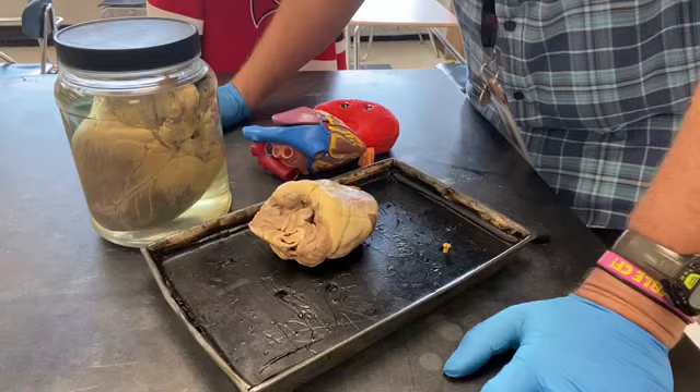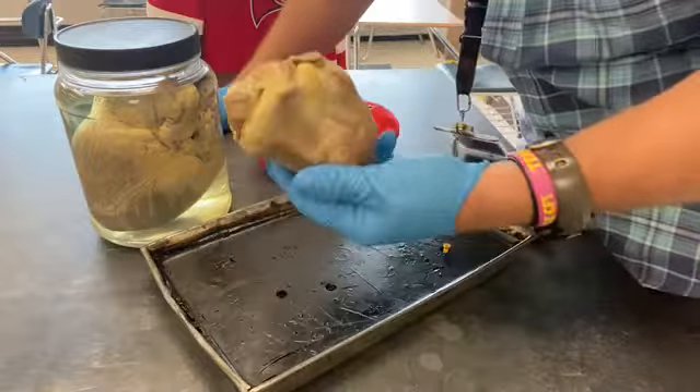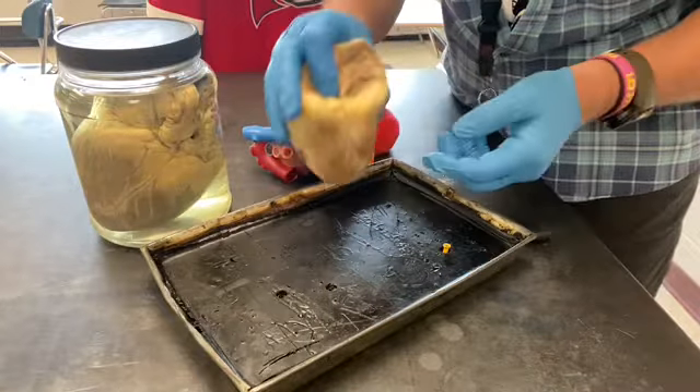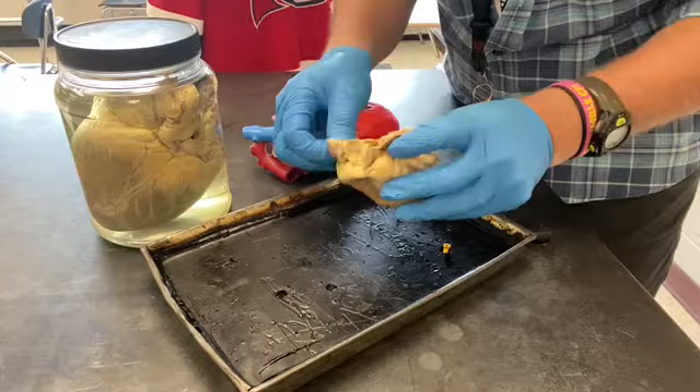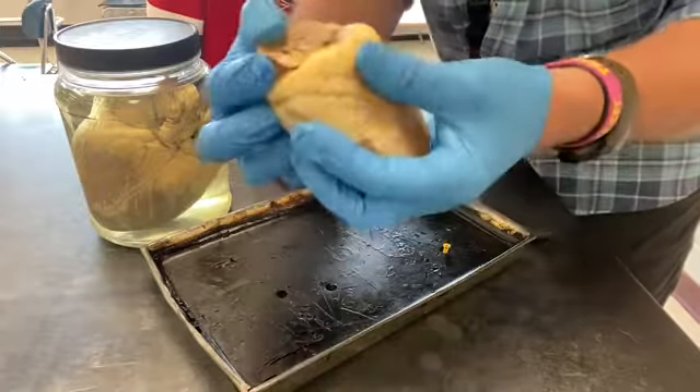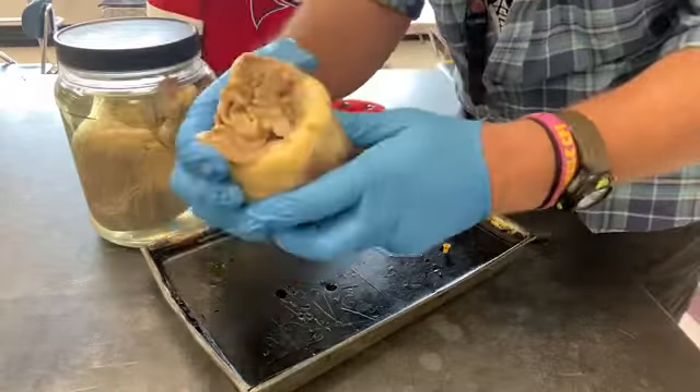The pointy end is the bottom of the heart; all the action takes place on the top. If you look at a heart, you can see these two little flaps on top — those are the atria. Their job is to receive incoming blood; they inflate like balloons. They're muscular but very weak, which is why they're so flimsy. You can see holes where blood vessels come out. Most of the meat of the heart is the ventricles. The yellow stuff on the outside is fat — adipose tissue — which serves as an insulator to protect the heart and help transmit electrical impulses.